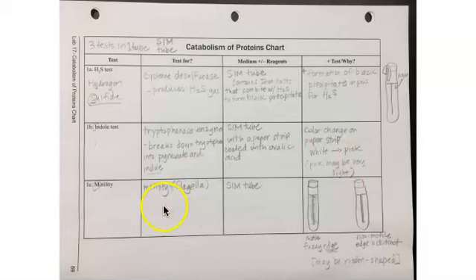And then for motility, we're testing really whether the bacteria have flagella or not. And a positive test on that would be a fuzzy line that's filling the tube, whereas the non-motile would have a non-fuzzy appearance, and the edge of where the stab is would be very distinct.